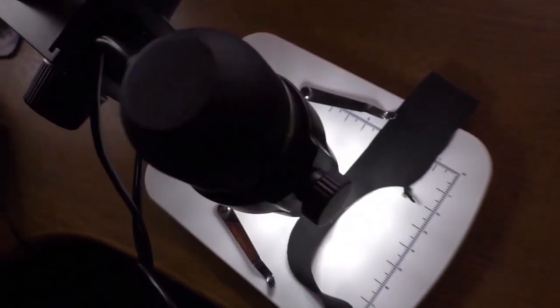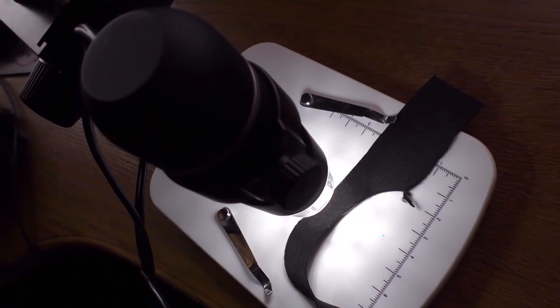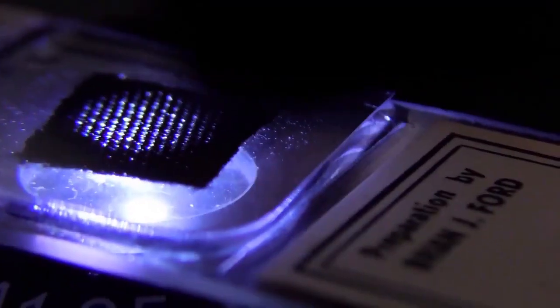This is the appearance of a popular fabric mask under the low-power digital microscope. Each aperture is a quarter millimeter in diameter.